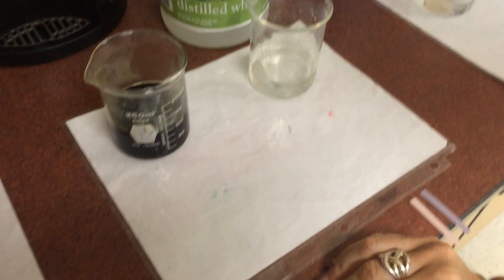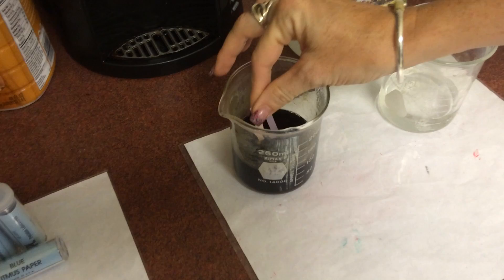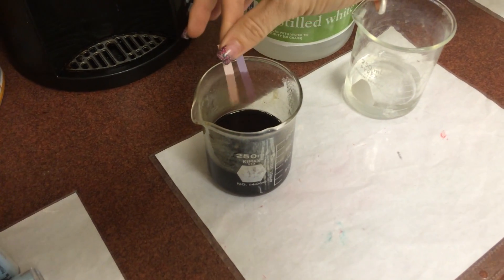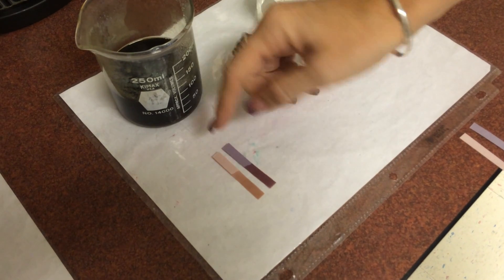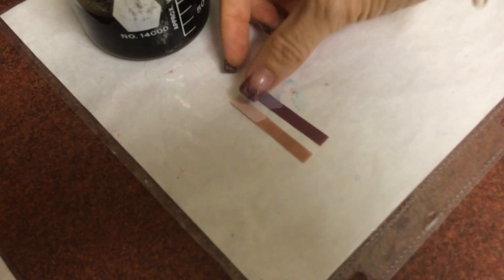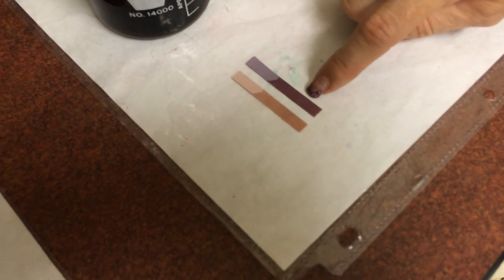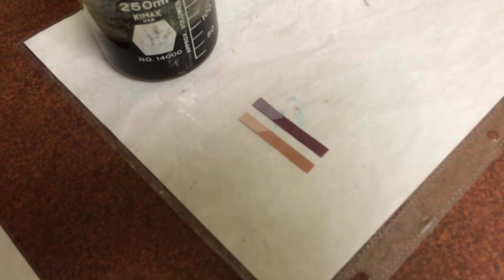We have a variety of substances here that we're going to test out. First we have some coffee, because everybody needs coffee in the morning. If I dip the litmus in the coffee, we can see that the red stayed red - it got stained a little bit with the coffee - and the blue is turning ever so slightly pink. So it is a very, very weak acid.